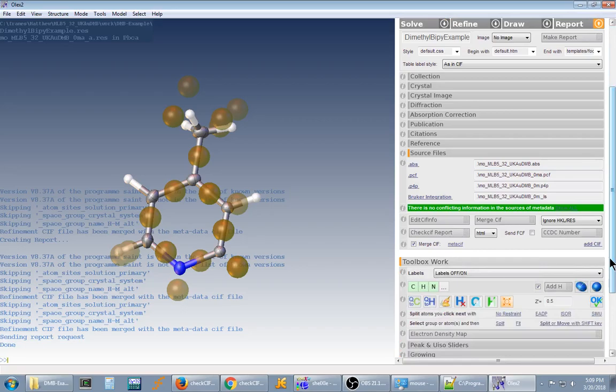And they're actively improving it, so I expect that this will actually get better. I'd really like it if it automatically could tell if numbers were different by a rounding error, as that would save a ton of collective one to two second clicks over time. But as you can see, it's quite nice, and I will link to their video which shows you how to expand on this, so that you don't have to manually edit the CIF file as much. You can make up files which you then will set as a meta CIF file, and it'll just automatically merge in. It's very nice, and I'll link that video by the OLEX2 team.